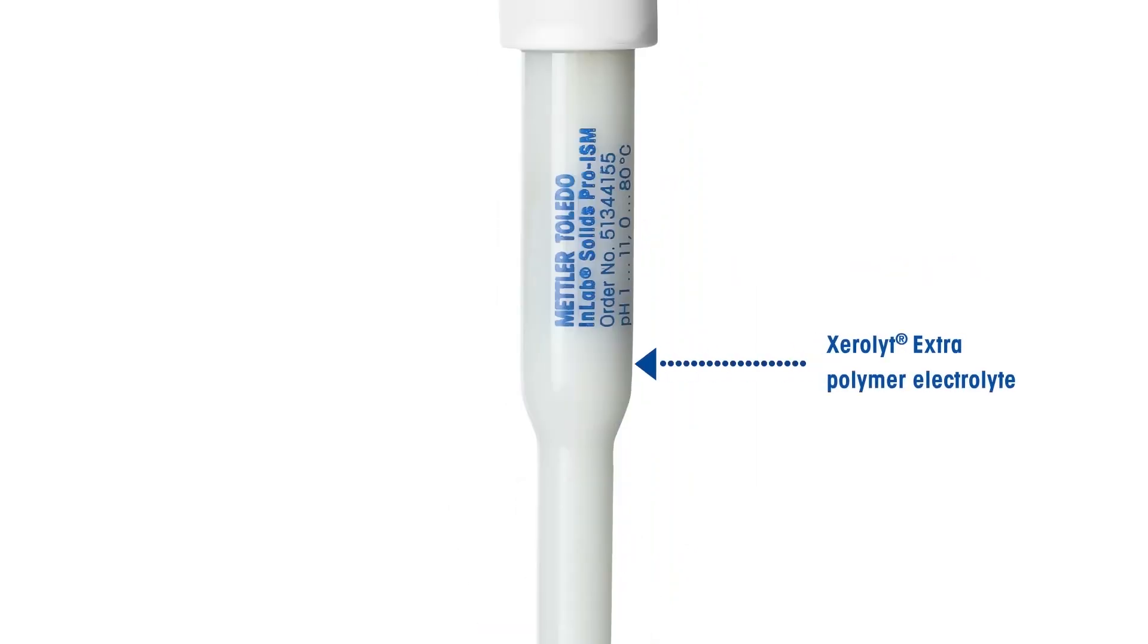Because of the solid Xerolyt polymer reference electrolyte system, the sensor interacts with the sample through diffusing ions, hence eliminating the difficulties associated with the miscibility of aqueous reference electrolyte with the sample. Also, no refilling of electrolyte is required.